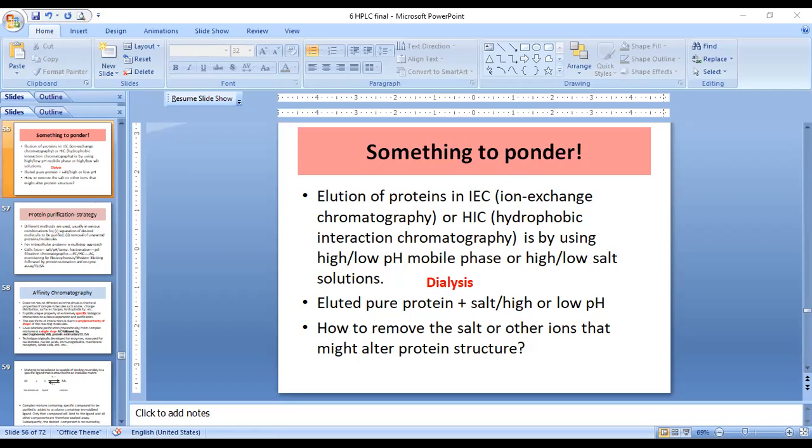And then the salt will move from high concentration to low concentration. So the salt ions, whichever ions are there in that sample component, will come out of the dialysis tubing or dialysis bag into the distilled water. So we have to give a number of changes. That is to say, we remove the dialysis bag after some time, because it is an equilibrium process, isn't it? After the equilibrium is reached, no more of the salt will come out.